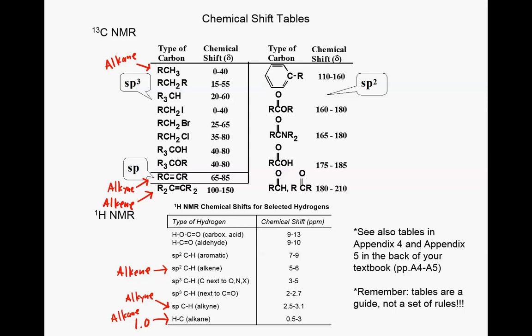All right, so we've got a carbon next to an oxygen. So we can see that those shift up here anywhere between like 160 and 210 when they're part of a carbonyl like that. So that's going to be very characteristic. Finally, we see aromatic peaks in the protons, about the most downfield that we've seen in practice. And so here we've got our benzene-like stuff. And so it's the same thing for carbons. We see our benzene-like stuff is pretty far deshielded. But so, yeah. Very similar trends in terms of the shifting.